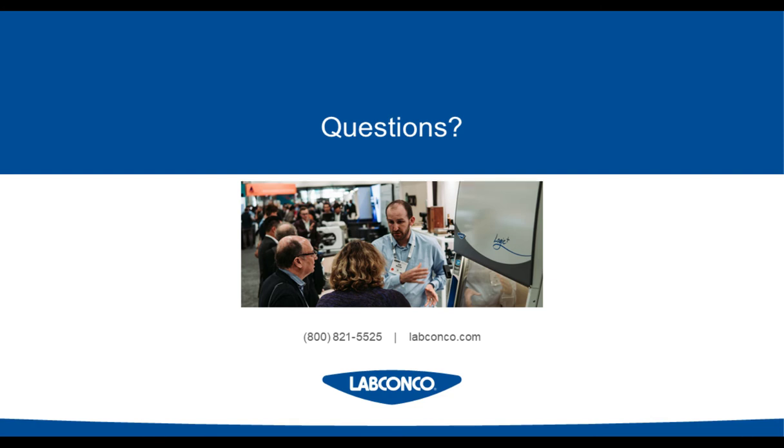Great, thank you. And our next question is, our lab has many different protocols that require BSCs. Is our Type A suitable for all types of BSC activities?